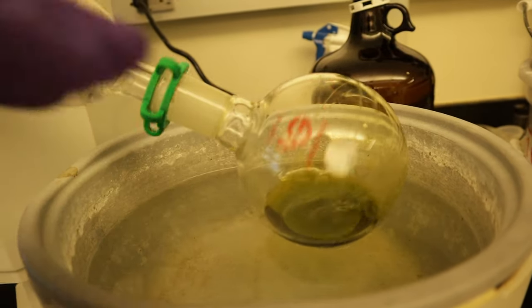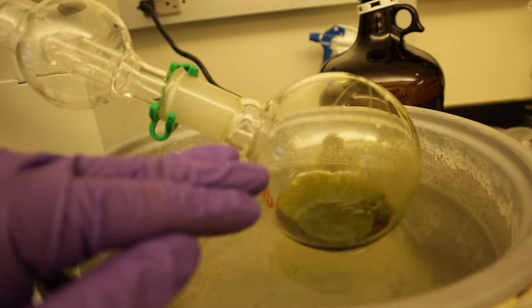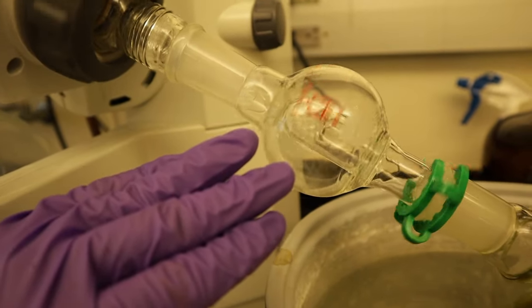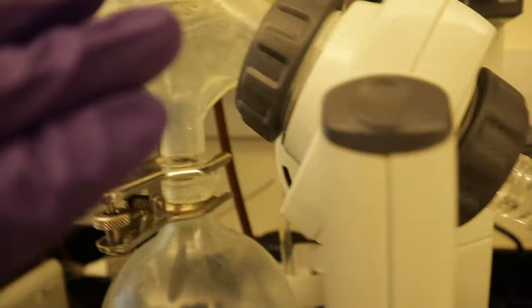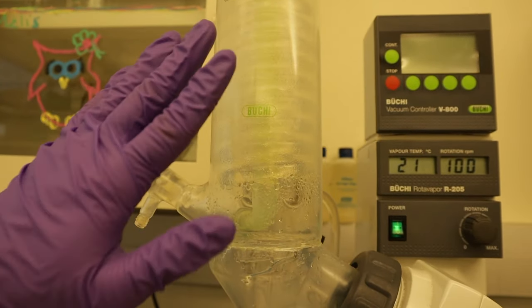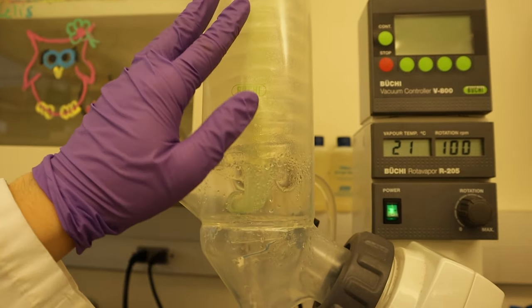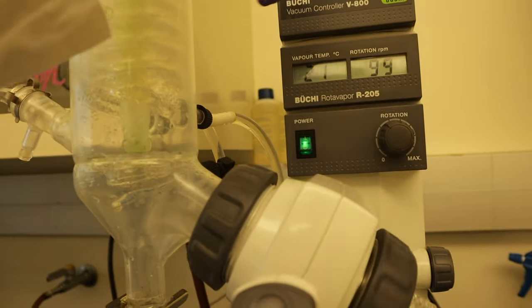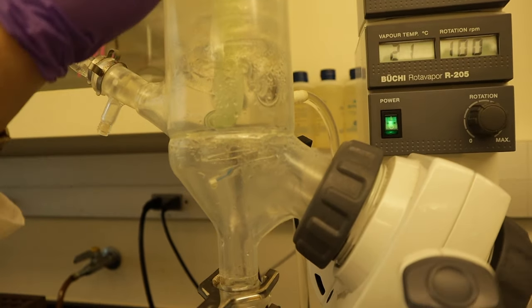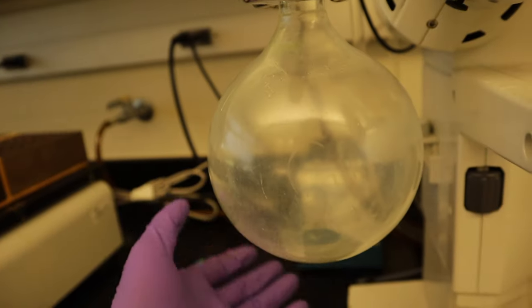The solvent contained in this round flask will evaporate here, then go here. In this part, the solvent that we use will be condensed because we have running water here. It will condense and all the solvent will be collected here.